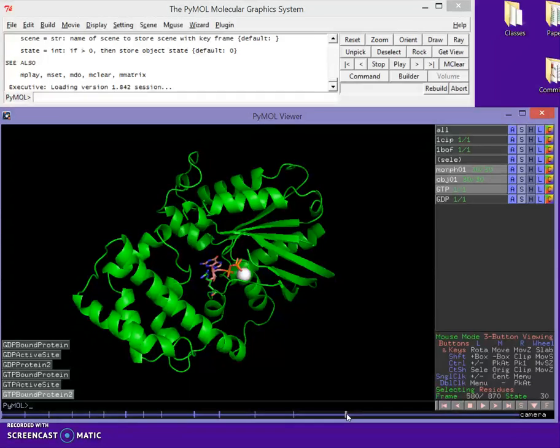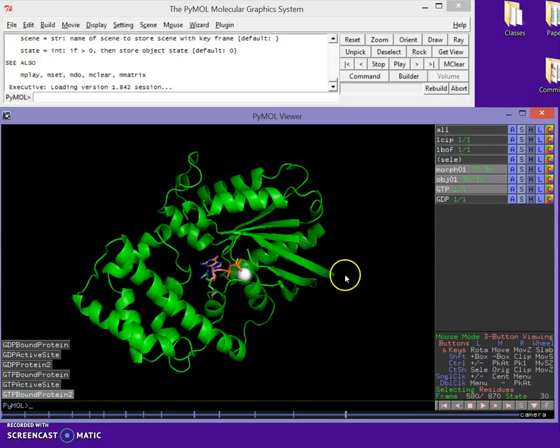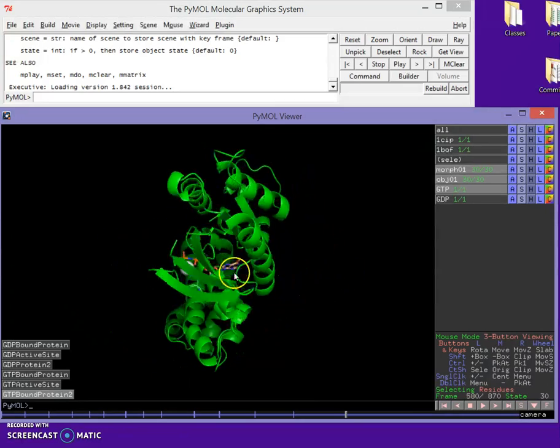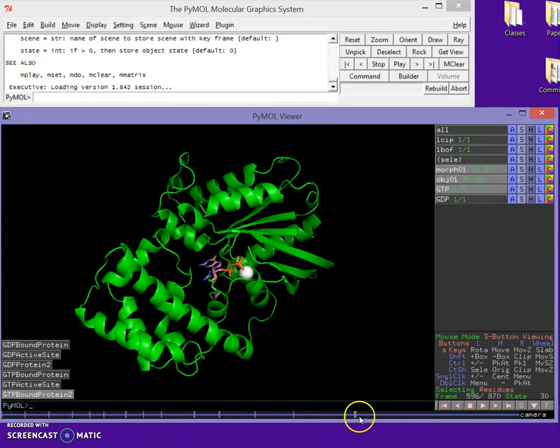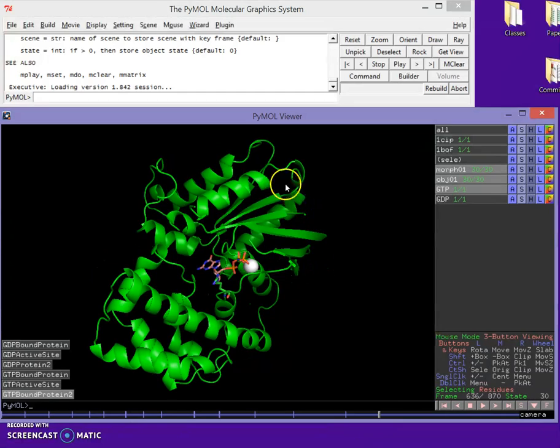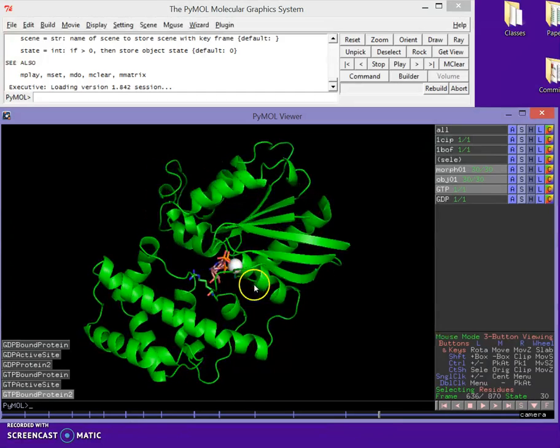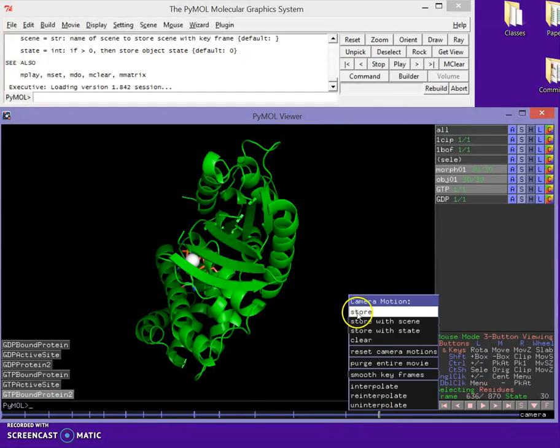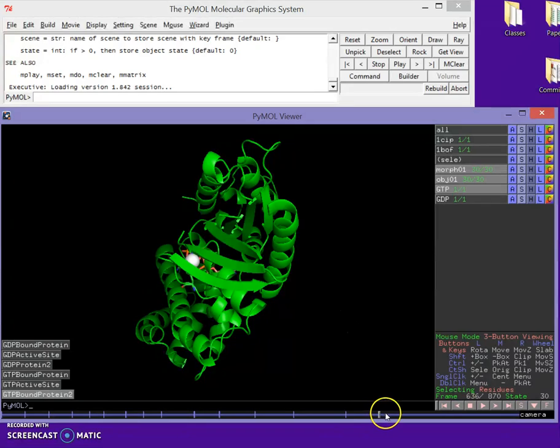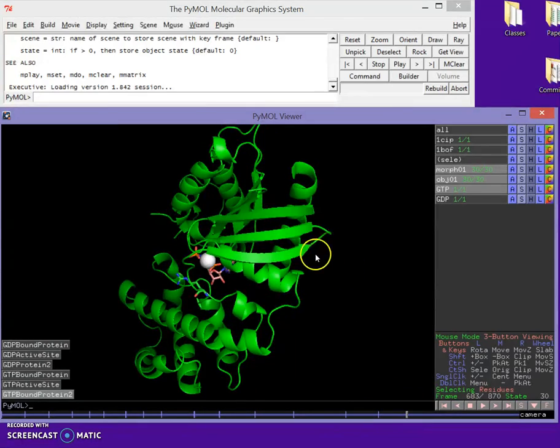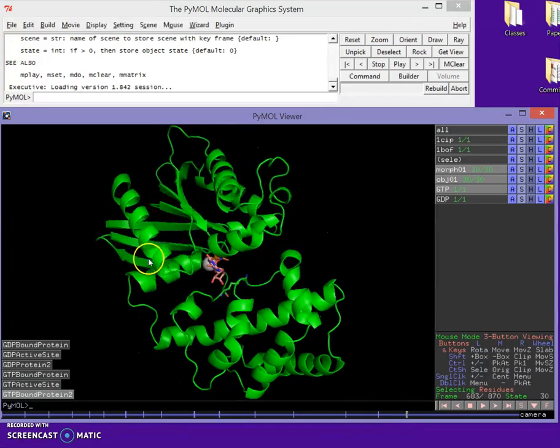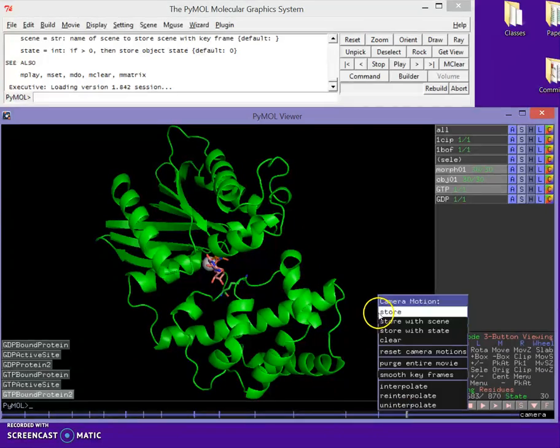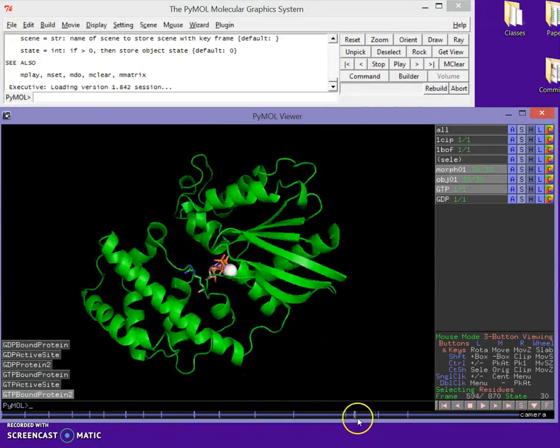So let's do some manual rotations here. I'm just going to right-click and hit store. And then I'm going to rotate this to myself somewhere. Go a little farther in the movie, and I'm going to spin this on my own. Store that here. I'm going to move a little farther in the movie and store it here, maybe. Let's see what that looks like.